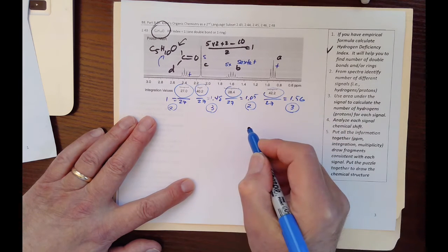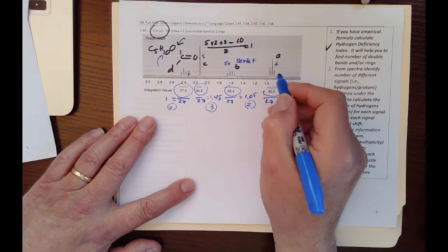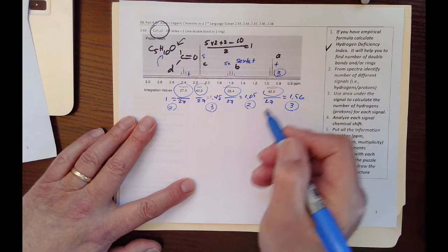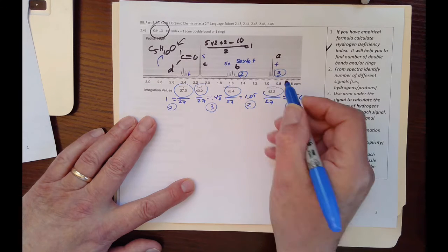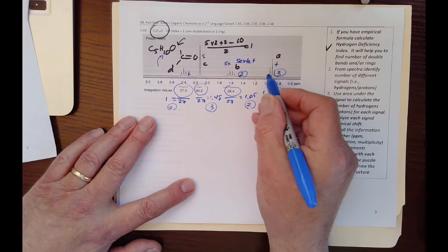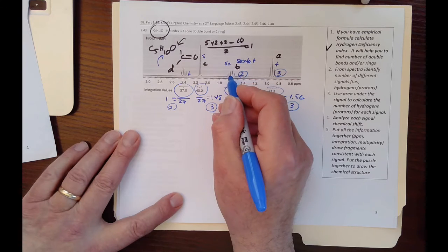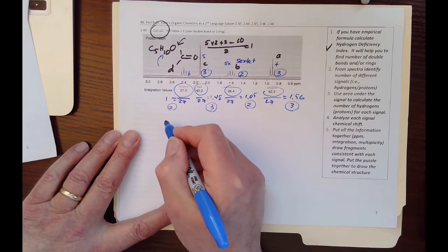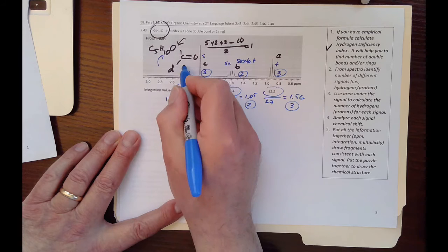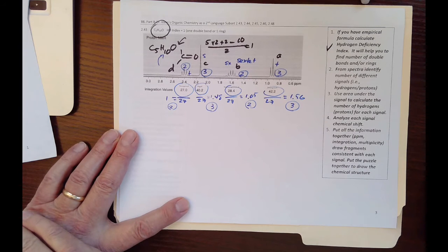So now I can put the number of hydrogen for each signal underneath it. For A, we would have 3 hydrogen. For B, 2 hydrogen. 3 hydrogen is represented by this signal, and the last but not the least, 2 hydrogen or protons are represented by signal D.